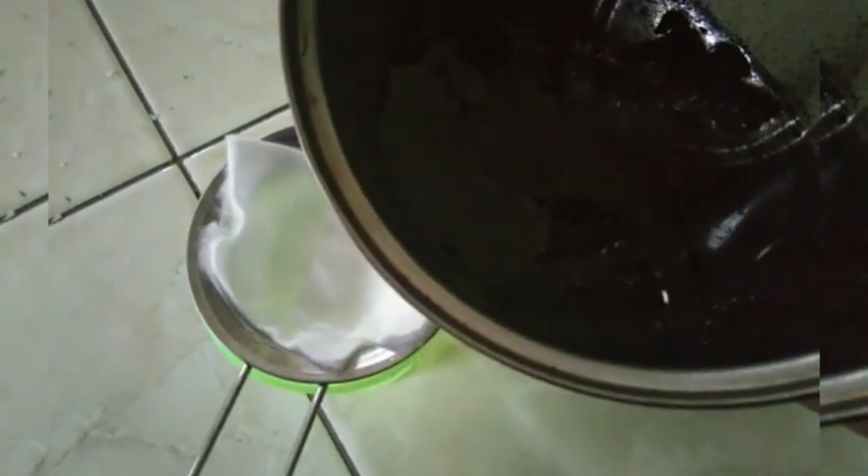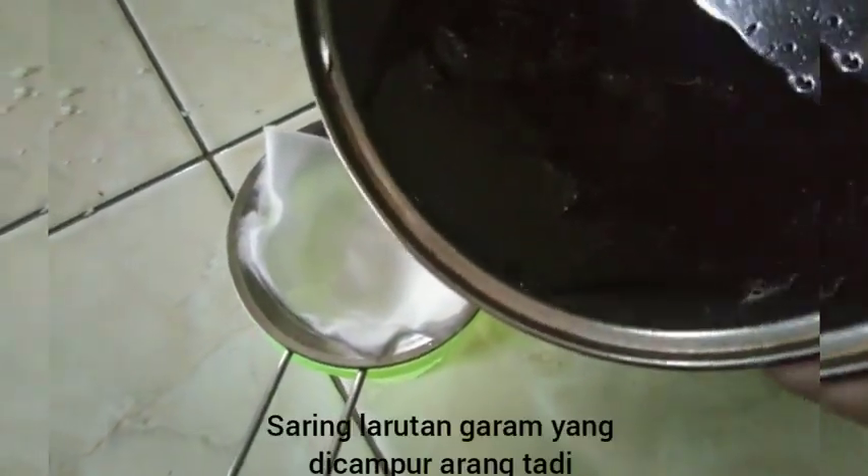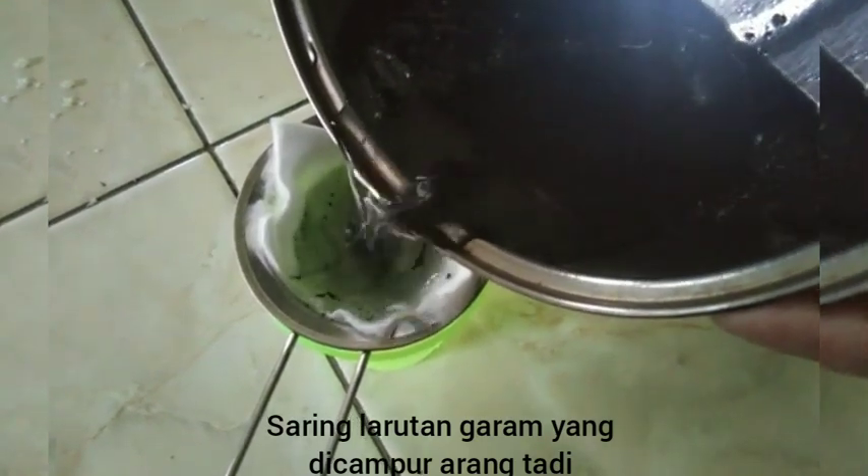After that, filter the solution again using a filter coated with cotton.